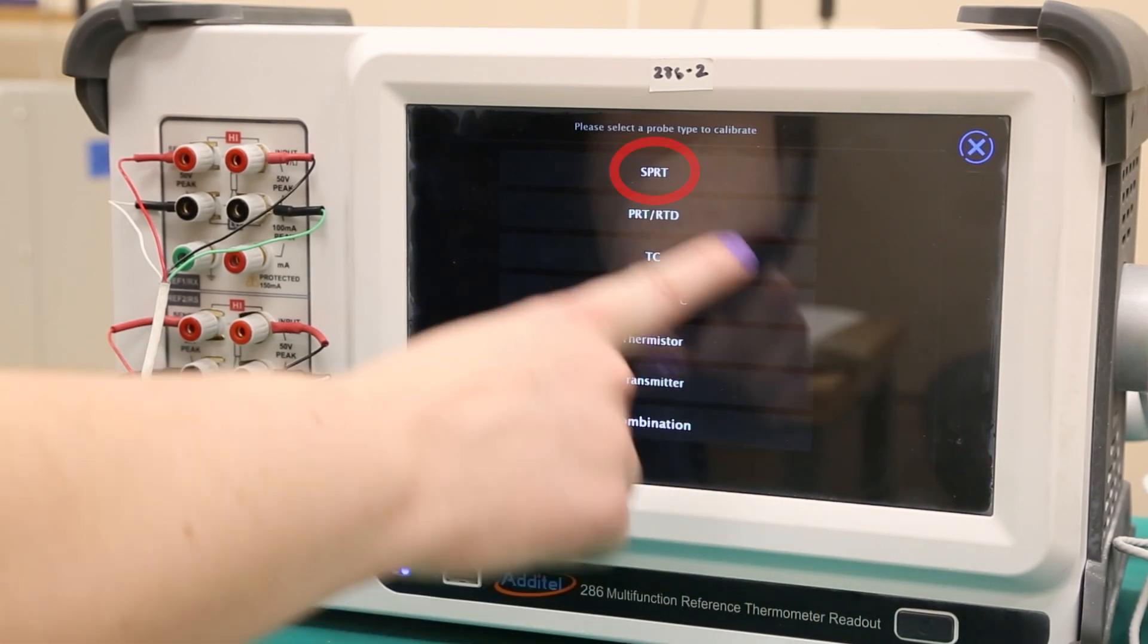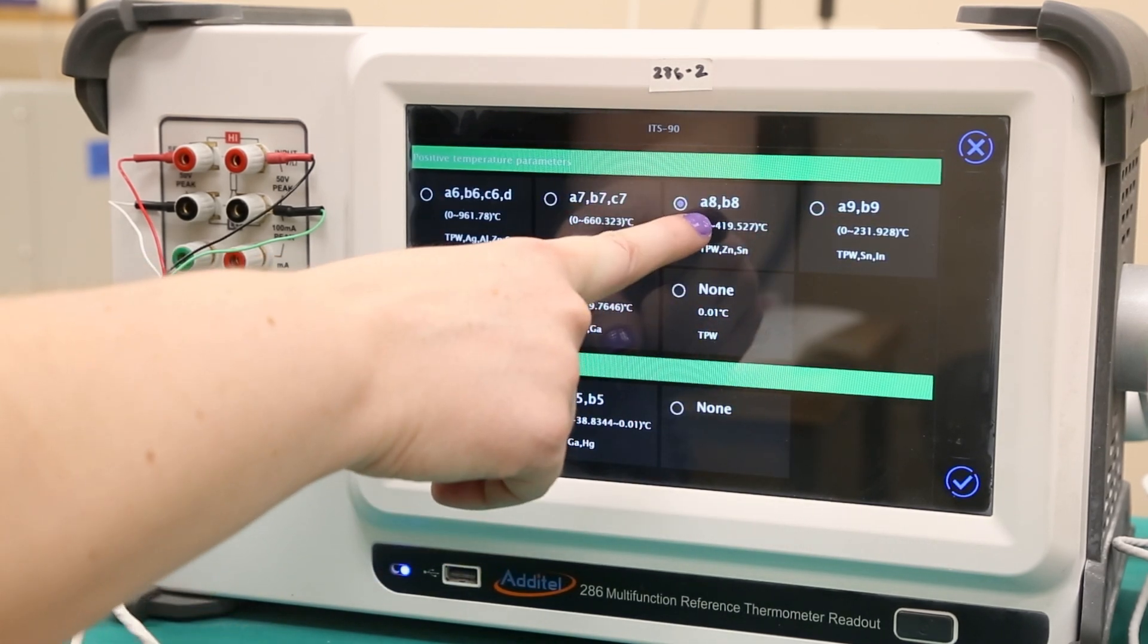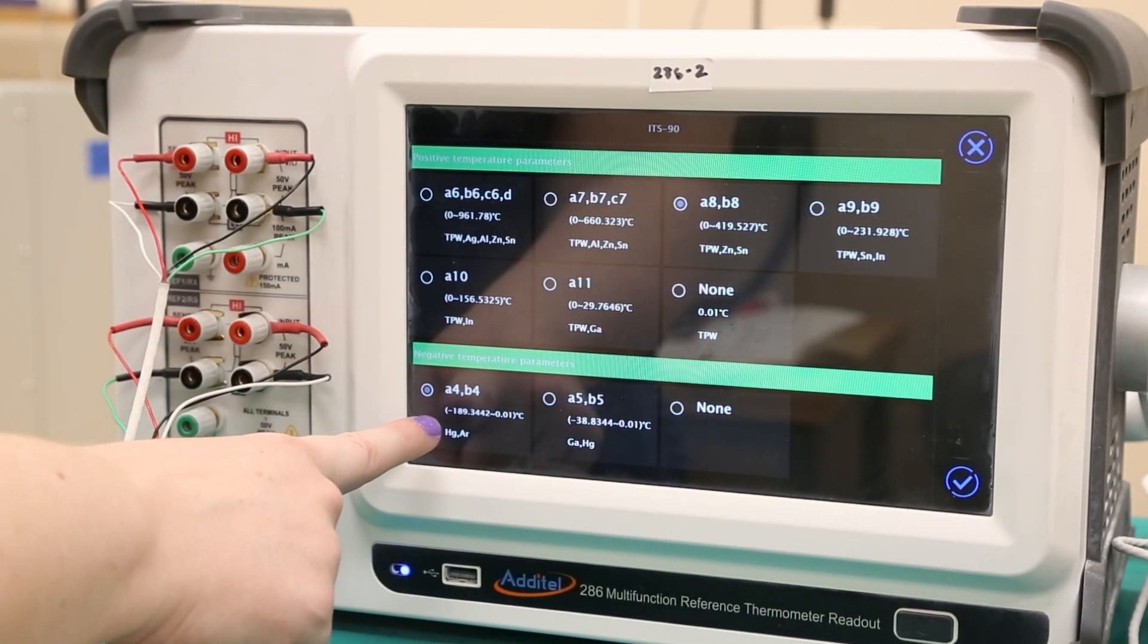Select the probe type, in this case SPRT. Here we can choose the ITS-90 sub-ranges we will be calibrating, which are eight and four as mentioned previously.